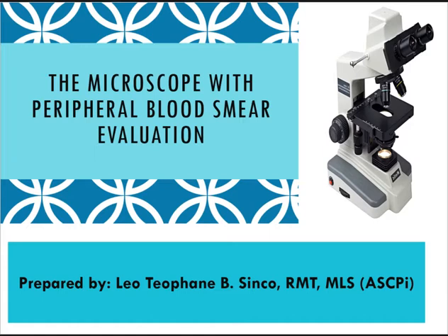There are a lot of microscopes that are available in the laboratory and, of course, in other research fields. And the last one would be viewing of some specimen in the peripheral blood smear evaluation using your different objectives. So basically, we are going to tackle those five categories or subjects within this discussion. So I hope you are ready to learn. So let's start with our program.